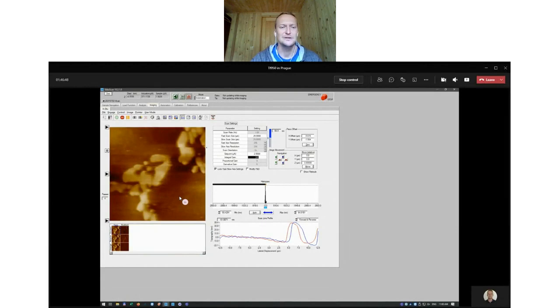The sample stays at this position. We use a scanner to see the topography and visualize the phases, and then we can use the scanner to position and target these specific phases. Since 1992, that was always the workflow with our instrument. You focus on your sample surface with the optics, or just approach with the tip, then you scan the surface area, and then you can use a piezo automation.